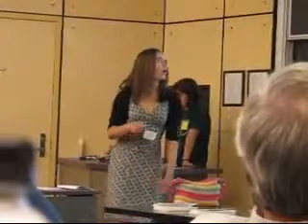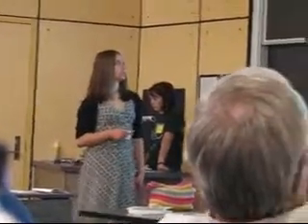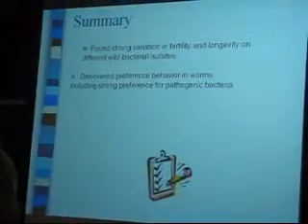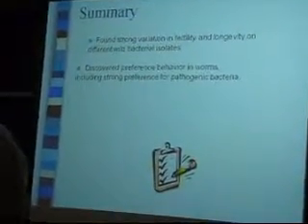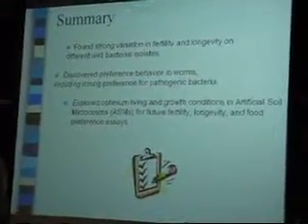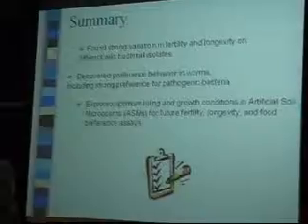So in summary, I found strong variation in fertility and longevity on different wild bacterial isolates. I discovered preference behavior in worms, including strong preference for pathogenic bacteria. And I explored optimum living and growth conditions in artificial soil microcosms for future fertility, longevity, and food preference assays.